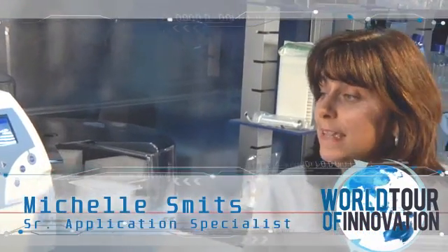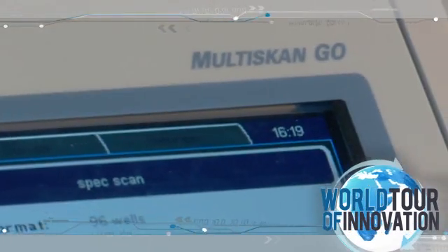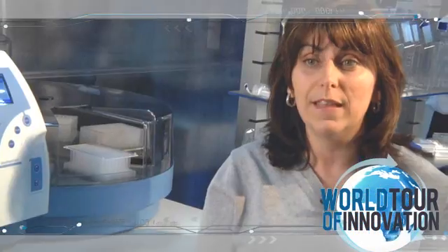The Multiscan Go is a spectrophotometric microplate reader. It can read both 96 and 384 well plates, as well as cuvettes. The system reads in the low UV range, which allows us to do nucleic acid and protein quantification, as well as into the colorimetric range, which allows us to do ELISA assays.